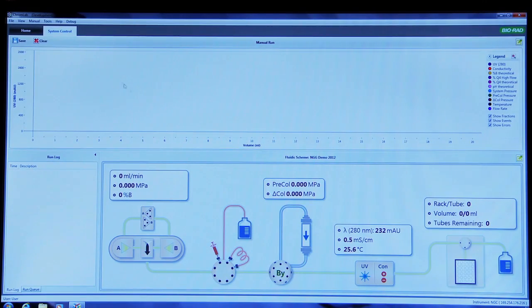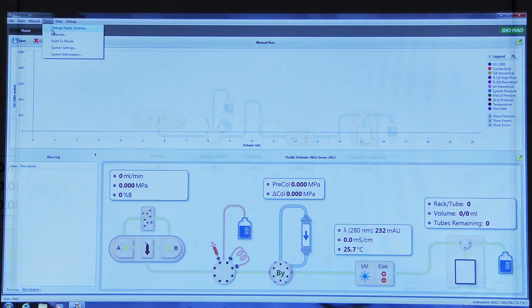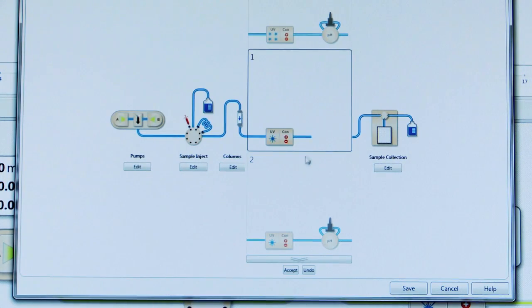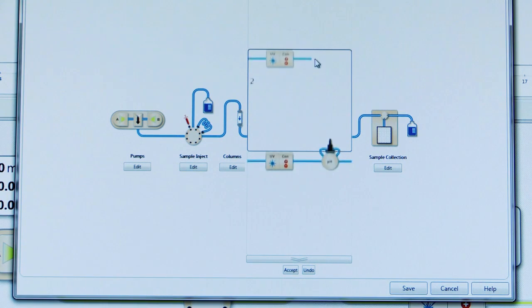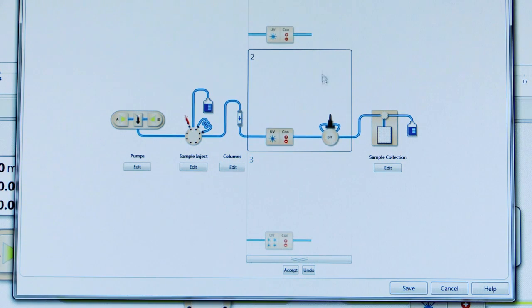Use Chrome Lab software to update your Fluidic scheme to reflect the installation of your new module. In this case, update with a pH valve added to the flow path.